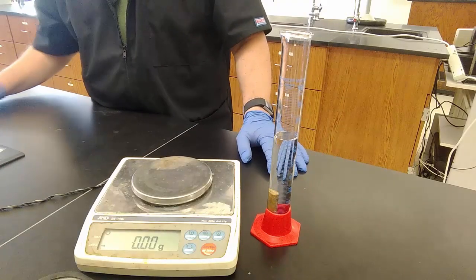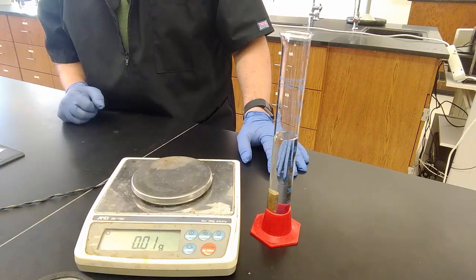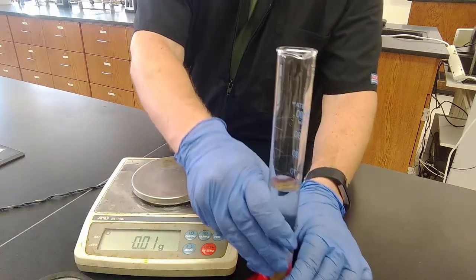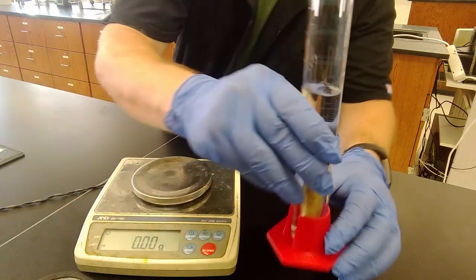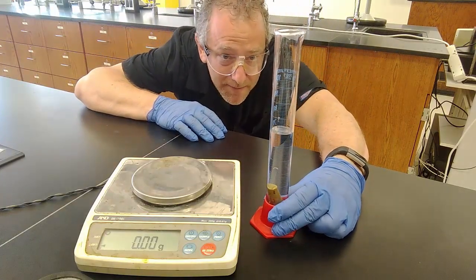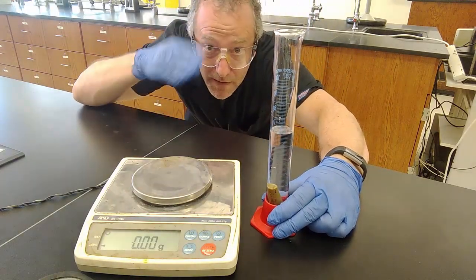All right. Now, step 5 says record the new volume of water in the graduated cylinder. And so again, I look at the bottom of the meniscus. Again, this is a little bit of an angle, so I can't really show it to you at camera level. But I'll get down there at eye level so that the meniscus is nice and flat for me. Well, curved, right?